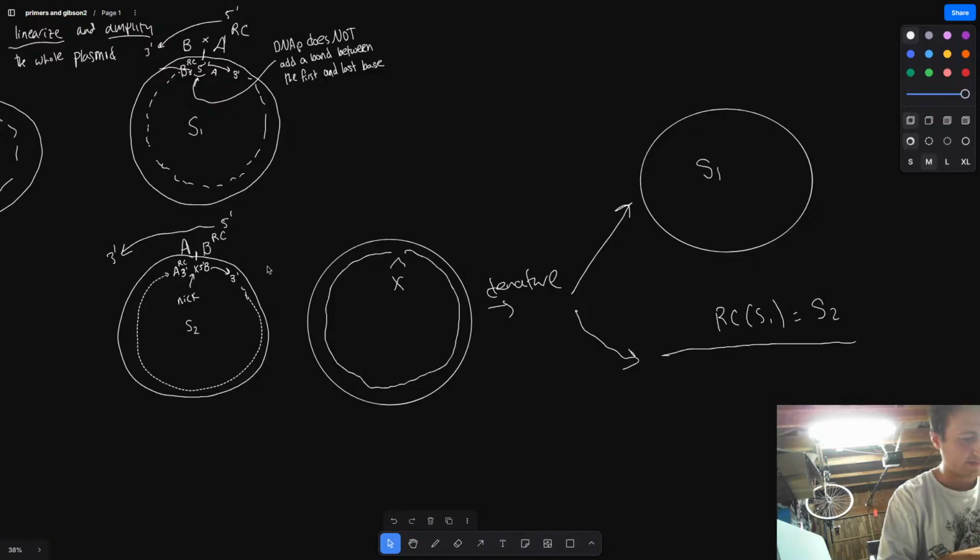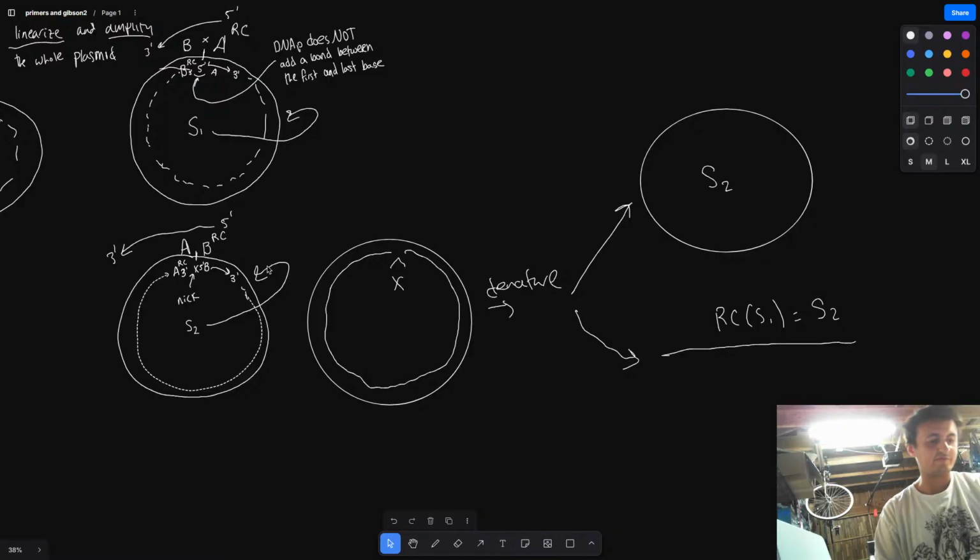Oh, wait. So, okay, wait. This has S1 on the outside. And this is S2. So this is not right. This is S2. And then we have the reverse complement of it, and that's going to be S1.